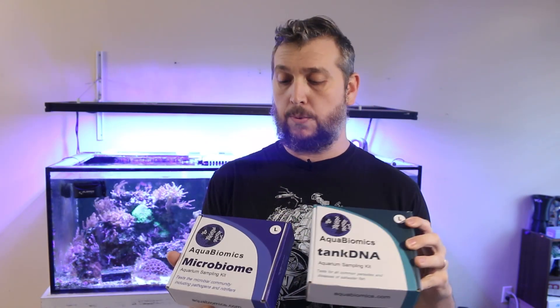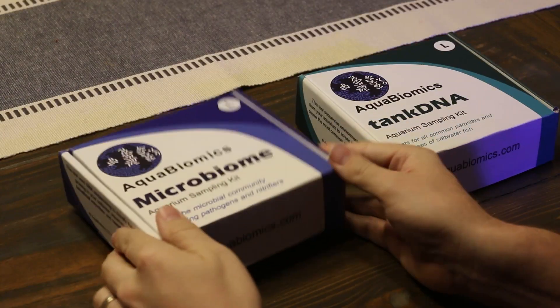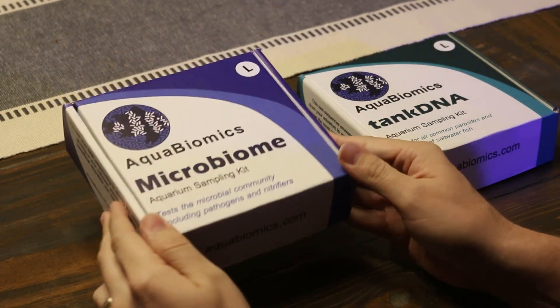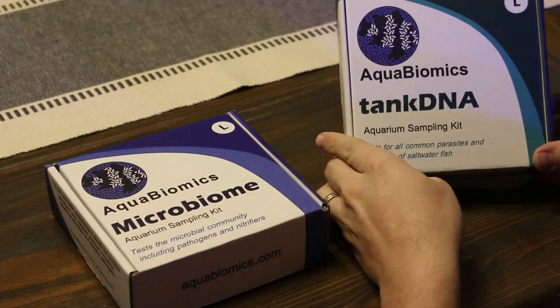I'm excited to do these tests. We're going to open these up, do each test, send them out, and then when the results come in we'll take a look at those as well. Here are the two test kits from AquaBiomics — you have the microbiome and the tank DNA.